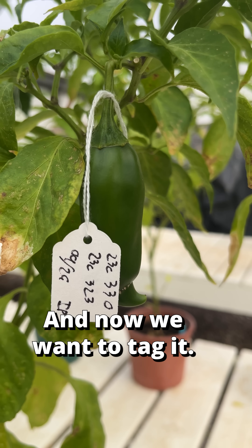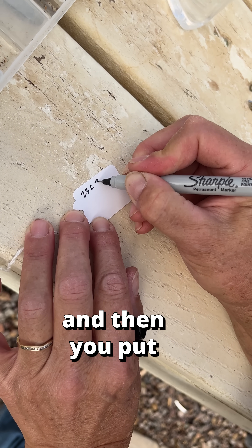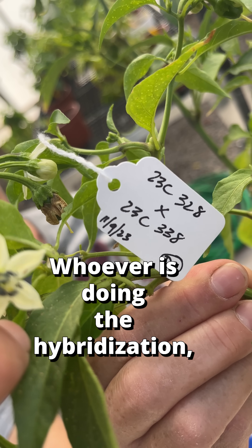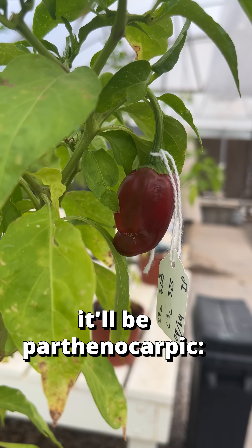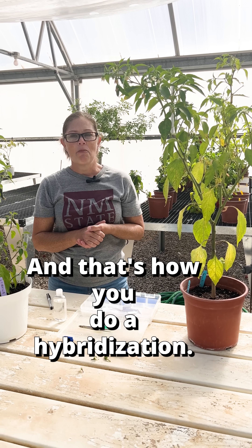Now we want to tag it. Horticulturally, we put the mother plant on the top, and then you put a little X for cross — that means the hybridization — and then you put the father plant on the bottom. Whoever's doing the hybridizations always puts their initials so we'll know who did it. And if you don't get enough pollen in there, it'll be parthenocarpic — no seeds. And that's how you do the hybridization.